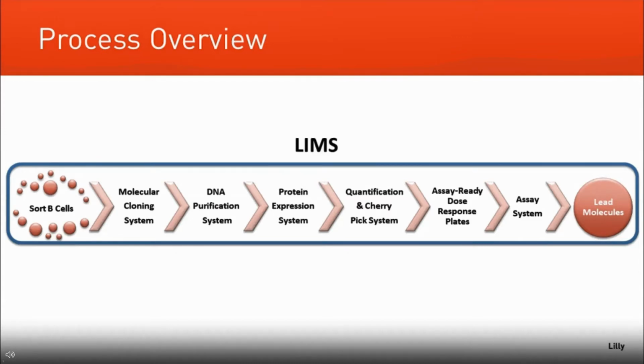So this is the main process I'm going to be talking about, this single B cell application. But keep in mind, a lot of these systems are used in different aspects of other biologics discovery efforts. And so this presentation is really just honing in on this application here.